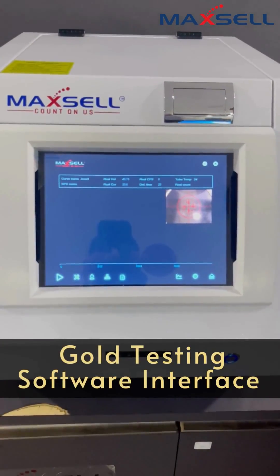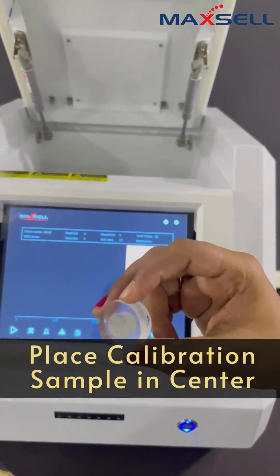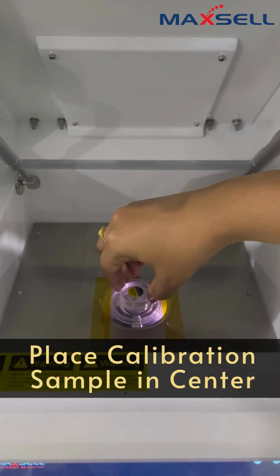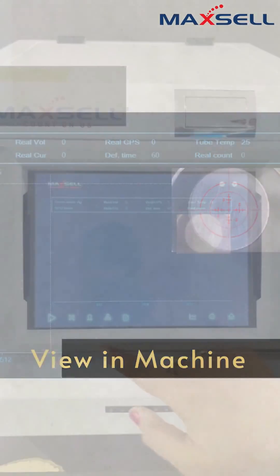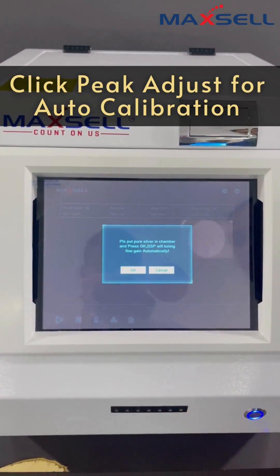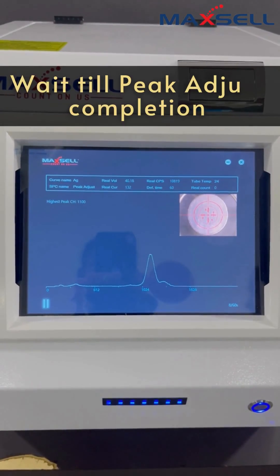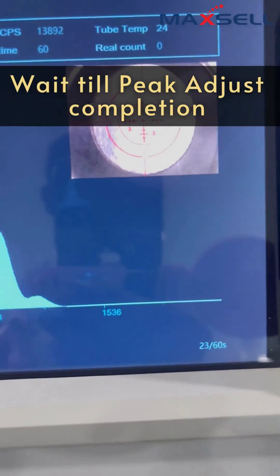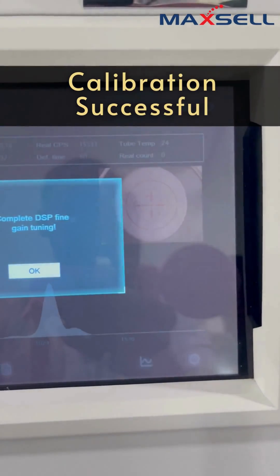This is the software interface. Now, calibrating the gold tester is very easy. Just place the sample in the testing chamber. Click the play button and choose peak adjust. Wait till the peak adjust gets complete. Now, the calibration is successful.